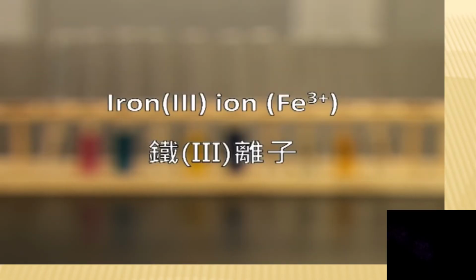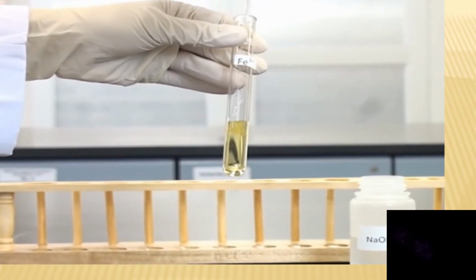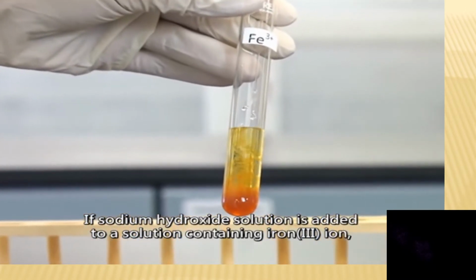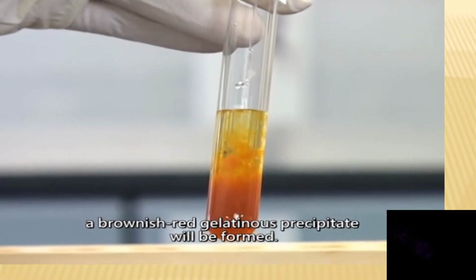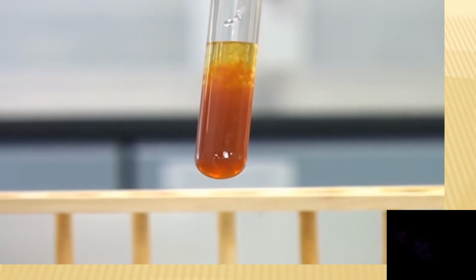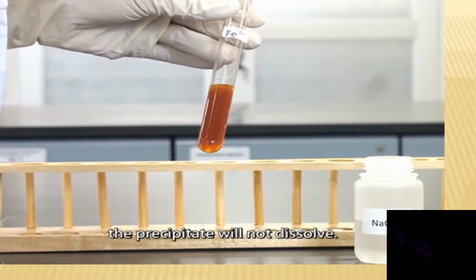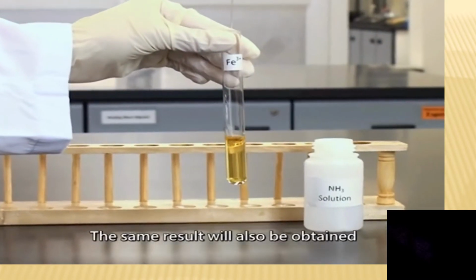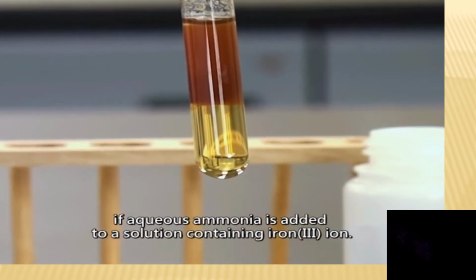Iron 3 ion. Iron 3 ion is a pale yellow ion. If sodium hydroxide solution is added to a solution containing iron 3 ion, a brownish-red gelatinous precipitate will be formed. It is iron 3 hydroxide. If excess alkaline solution is added, the precipitate will not dissolve. The same result will also be obtained if aqueous ammonia solution is added to a solution containing iron 3 ion.